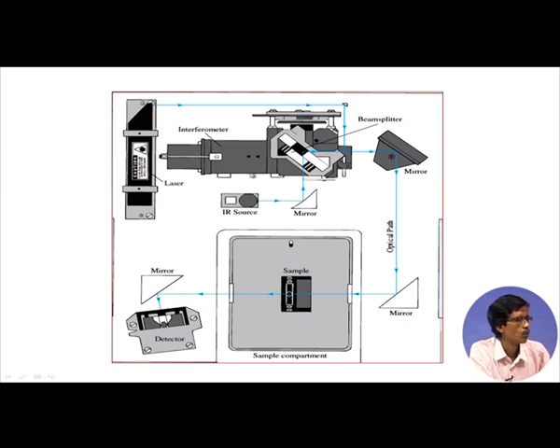So, this interferometer is basically responsible for recording the corresponding signal amplitude when we have the chopping off and on of the radiation which is forwarded to the sample. Then this again goes via the mirror, and this optical path is again guided by the mirror.